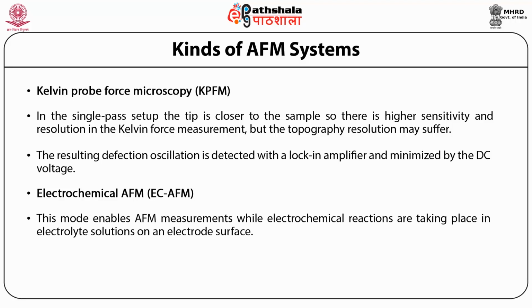The other microscopy belongs to electrochemical AFM or EC-AFM. This mode enables AFM measurements while electrochemical reactions are taking place in electrolyte solutions on an electrode surface. Electrochemical reactions are processes in which electrons flow between solid electrodes and liquid electrolytes, accompanying a reduction reaction at the cathode and an oxidation reaction at the anode. These reactions are widely studied in applications such as corrosion and photovoltaics.